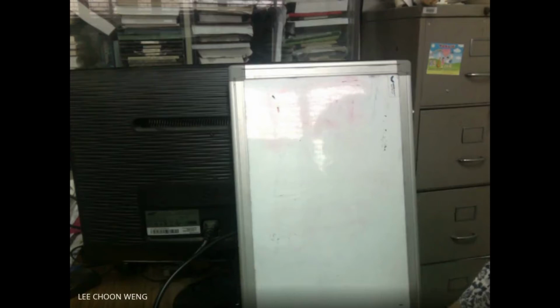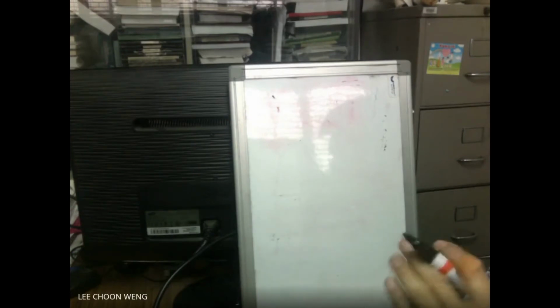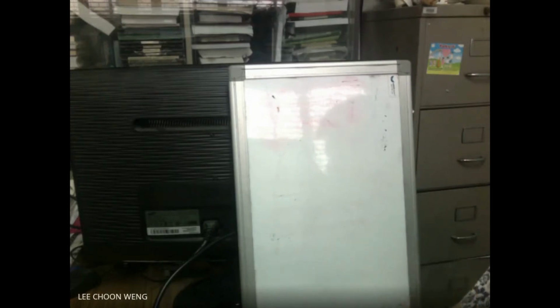So for the questions for the Winogradsky column. Number one, why do we ensure that no bubbles are trapped? I've already told you the answer. We need to make sure that no bubbles are trapped because for the Winogradsky column to work, there has to be a dissolved oxygen gradient from the surface to the bottom. If there are bubbles trapped, you won't get nice layers of microorganisms.